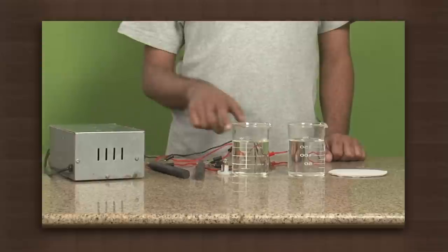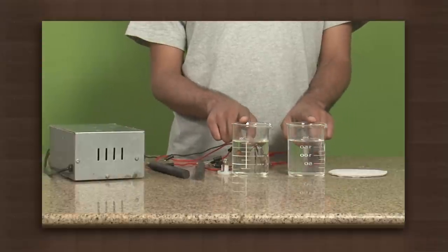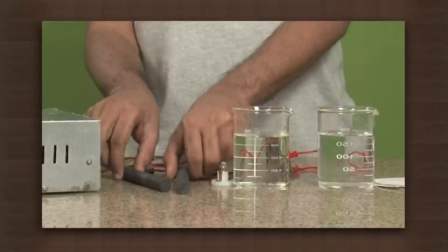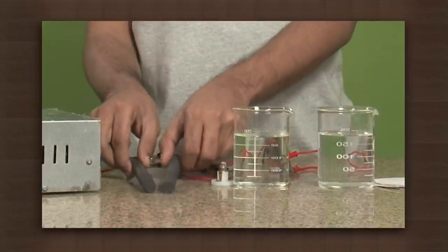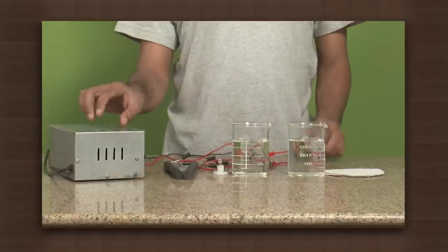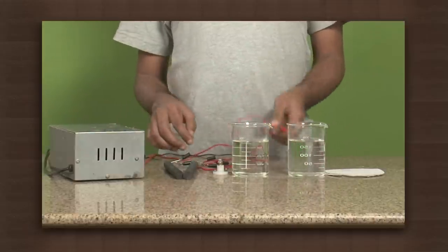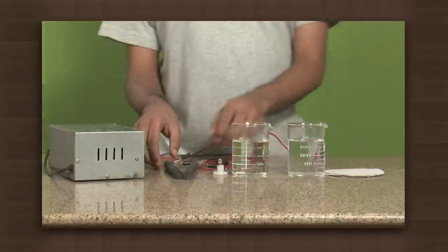For this, we will use an acidic solution of hydrochloric acid and a basic one of sodium hydroxide. Beside these, we will need beakers, two carbon rods, bulb, battery eliminator, wires, and filter paper.